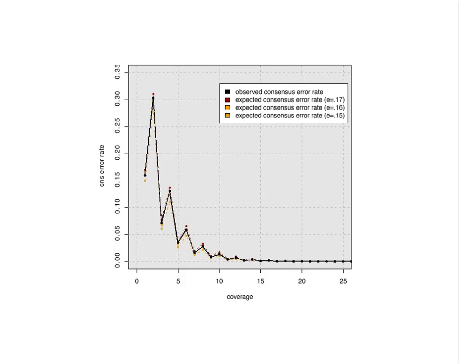Bob asks, if you clip parts of the PacBio data that don't have Illumina mapped reads, do you see issues where the reason for the absence of the Illumina reads is GC content, so it is real sequence? Grammatically, I'm not sure if that makes sense, but did you get that? I can speak to it a little bit. I think the question is, when there are gaps in the Illumina coverage, what's causing the gap? Is it a GC bias problem?